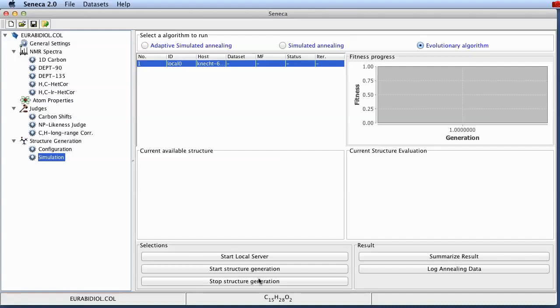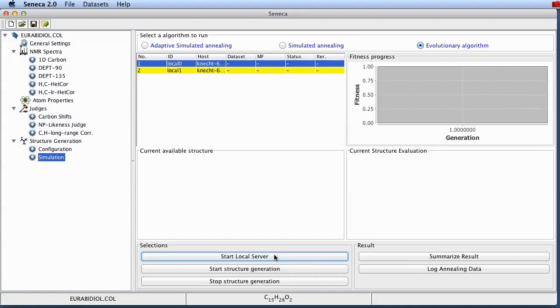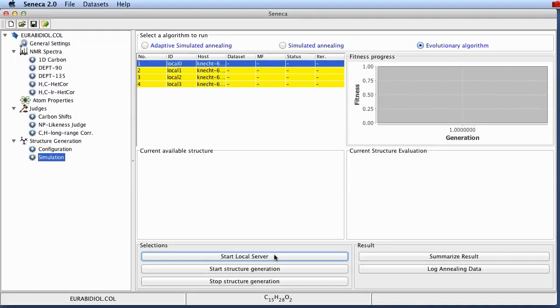Also in this case we want to increase our chance to find the global optimum by starting a couple of local servers. We just do this by clicking here on the start local server button. Let's start 4 servers. You can also use 8 or 16 depending on how powerful your machine is. Some modern desktop machines have 8 cores or even more. So you should be able to do this.